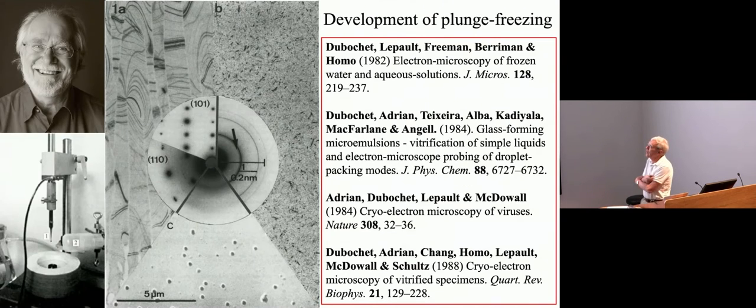Okay, so then we come to Jacques Dubochet's work after he went from Basel with Kellenberger in 1978 to EMBL, recruited by John Kendrew to investigate high-resolution EM and the behavior of ice and how to preserve specimens. And he worked from 1978 to maybe 1982 or so, looking at the behavior of water. And this is his famous picture, really, which is electron diffraction patterns of different types of frozen water that were prepared in the electron microscope.